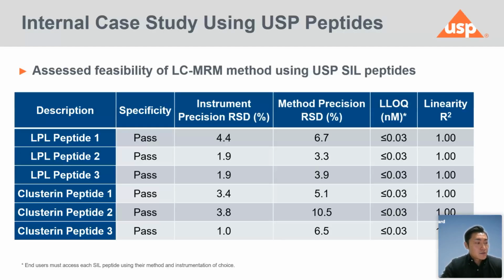We analyzed the following samples: the labeled peptides in diluent, 1 nanomolar labeled peptides in diluent, and samples including USP mAb 003, CHO HCCF, CHO protein A pool, and CHO IEX without spiked-in labeled peptides. For specificity, in samples lacking the spiked-in labeled peptides, no labeled peptide peaks were observed at the expected retention time using our MRM method.